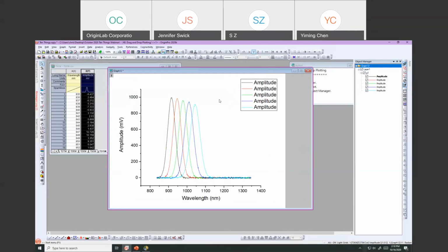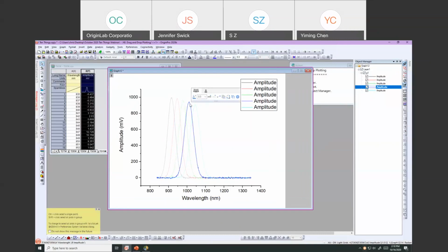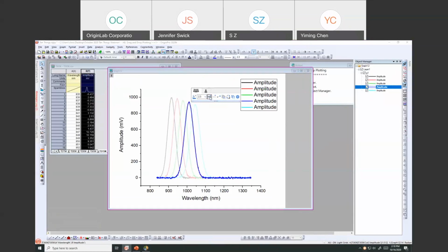All right, so let's go ahead and first change our plot size. Then we're going to change our color list. I will click on one of the plots to select it. I get my mini toolbar, and I waited too long, and I'm going to use this increase line thickness button just to jack up that line thickness a little bit.